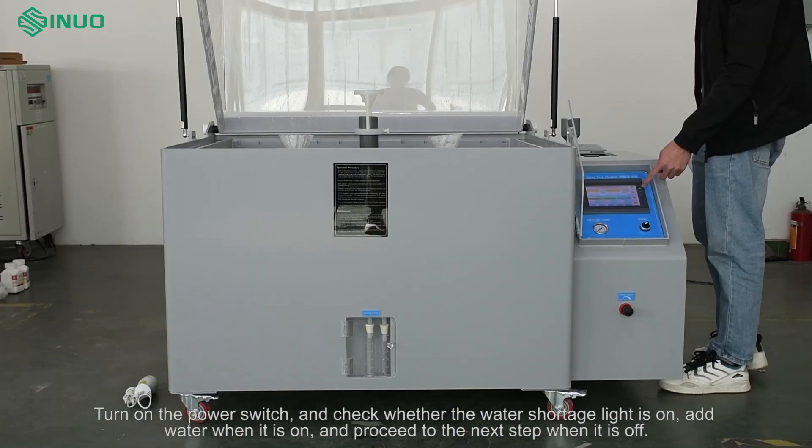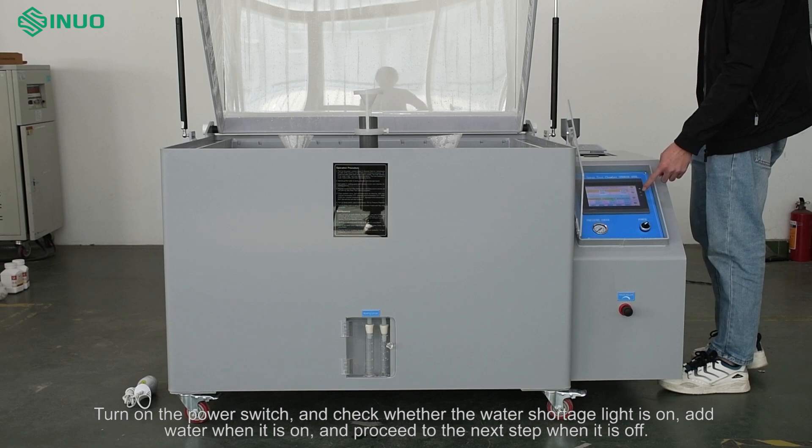Turn on the power switch. Check whether the water shortage light is on — add water when it is on, and proceed to the next step when it is off.